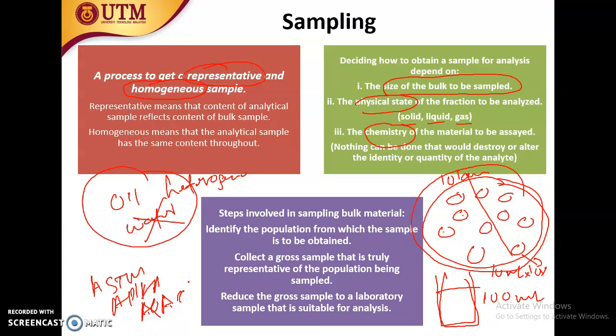Okay, so this is easier when you want to defend your data in court, whereby you will be asked by, for example, a lawyer or judge, how do you sample? Okay, you said I follow the ASTM method on collecting water at 10 points. This has been validated and used around the world and is also verified. That's it. That's the answer.